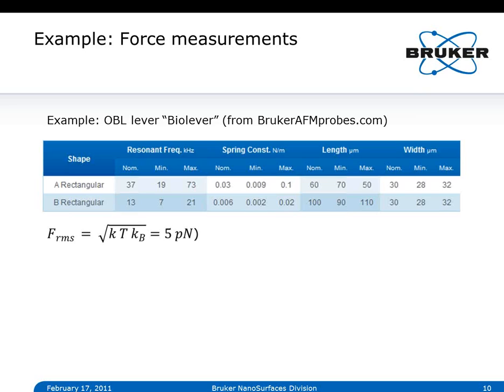So you will not be able to go into the femtonewton or even lower range. That is a limit given by the cantilever that you choose. So you can see that the AFM in this specific case is absolutely not the limiting factor, taking of course that you start with a good AFM in the first place, but it is actually your cantilever that limits your ultimate force resolution.